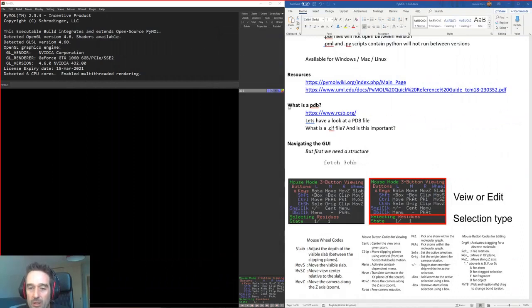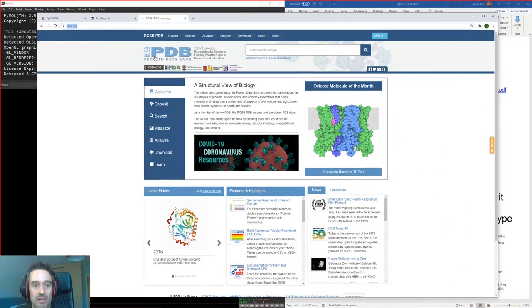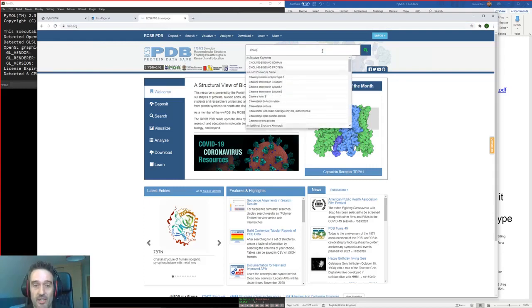So a good question at the very beginning. Obviously some of you are intermediate users here and you know what a PDB file is, but we may have some people with us that don't know what a PDB file is, or what it looks like. You can go to here and find the Protein Data Bank, and from here you can search for any particular protein of your choice.